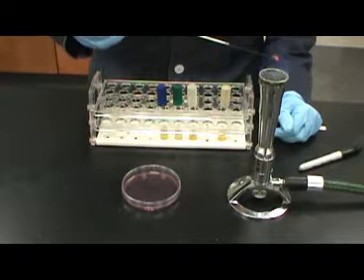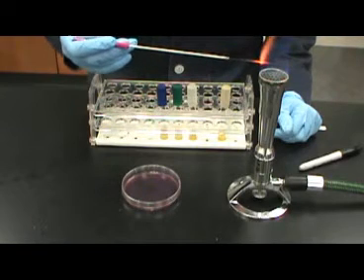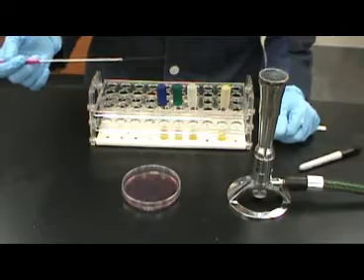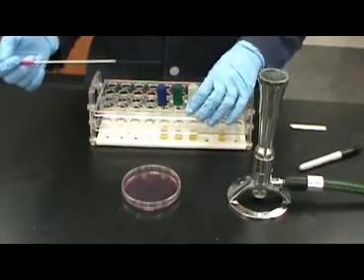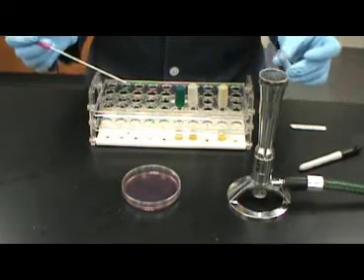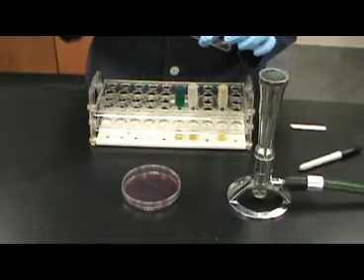Now that your plate has been labeled, you may begin inoculation. Remember, MacConkey agar is inoculated as a simple plate inoculation. There is no need to gouge or puncture the agar at any time. Be sure to use aseptic technique for each transfer.